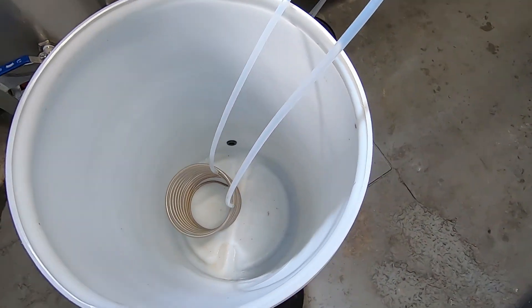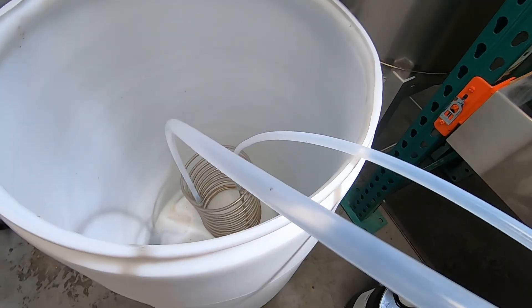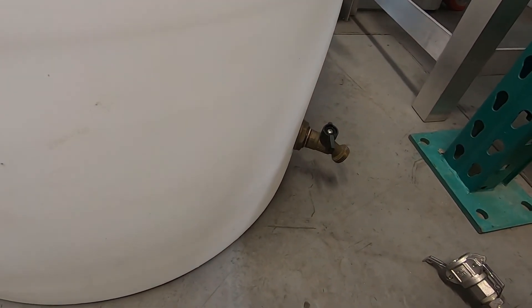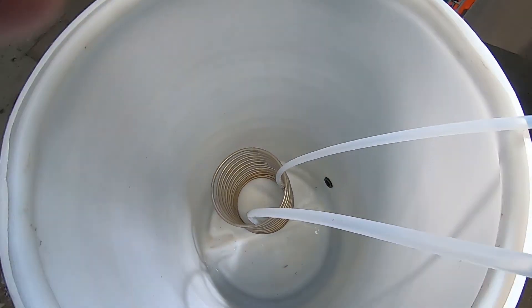Overnight it'll usually cool back down. If you put bleach in the water you can run it — I was running mine for over a month without ever changing the water. I put a little drain on it down here just to make it easier to change whenever I was ready. It works fantastically.